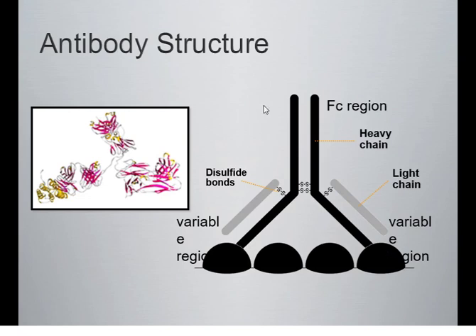And that's one of the powerful reasons for using these antibodies in the ELISA: they're able to bind to and attach to only that protein and no other protein, so that you're not getting false negatives or false positives, right? You don't want to detect something that's not that protein and say, oh, you have the virus, when you really don't.